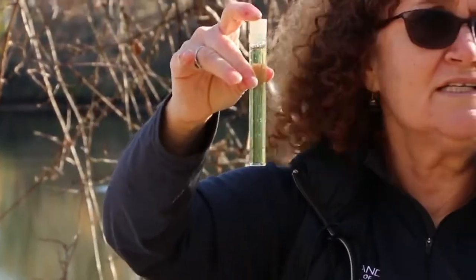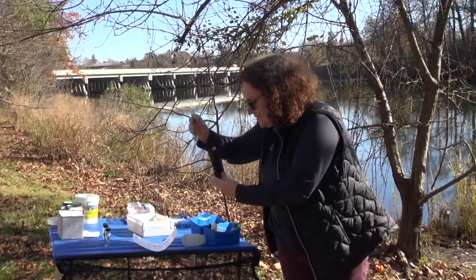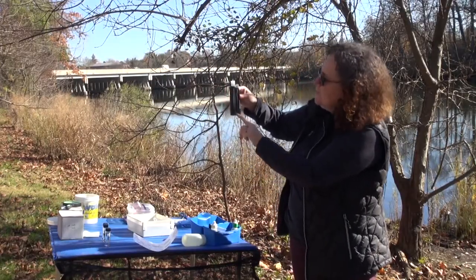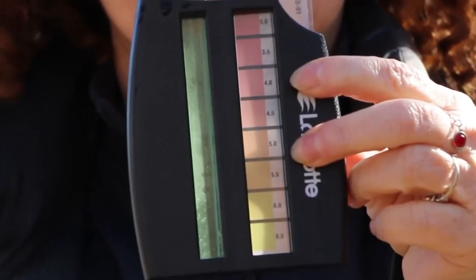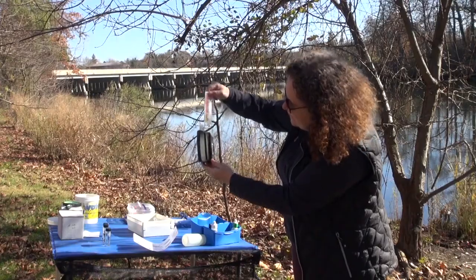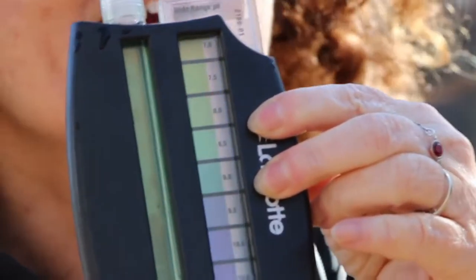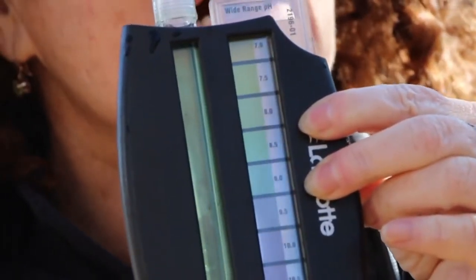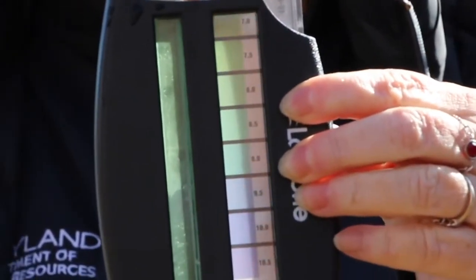You can already see the color change. I'm going to slide the test tube here and compare the color. You don't want a lot of direct sunlight coming behind. I would actually say that is about 7.0, which is a neutral pH, which is excellent. All aquatic organisms can live in a neutral pH.